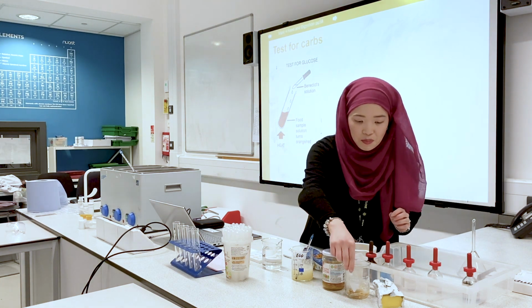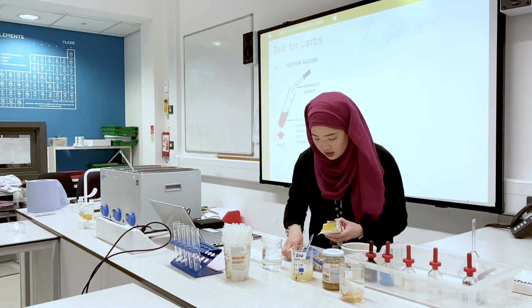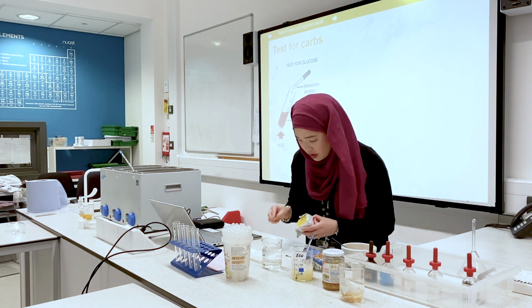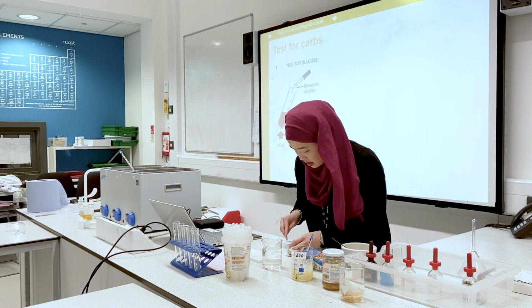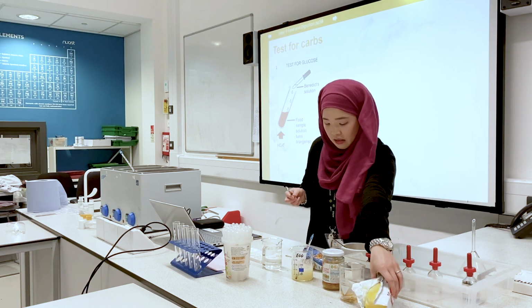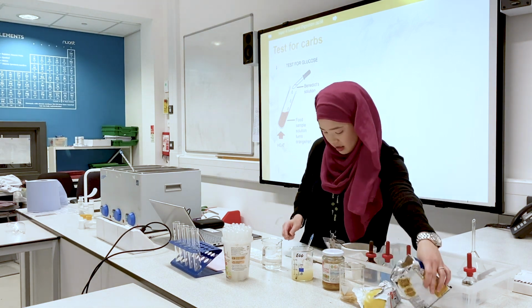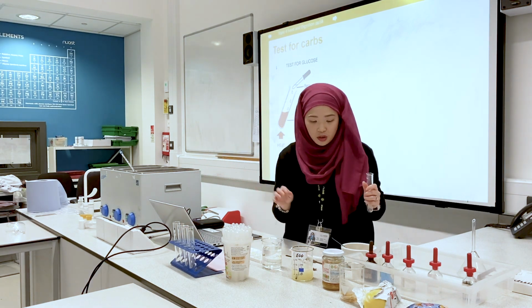I also have some butter, which I'm going to scoop in. Butter, I need to put in a test tube because I will be testing for glucose as well.